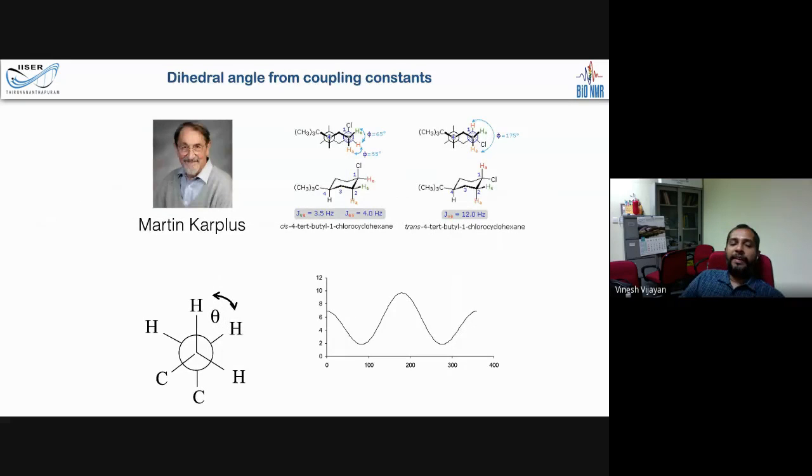There is also a way of determining the dihedral angle of your molecule. It's through the Martin-Karplus relationship. I don't have to write the relationship, but this is the graph of that relationship. This is a quadratic equation in cos theta, and this is the graph of that equation. So what you do normally is find that this is the dihedral angle, and this is the coupling.